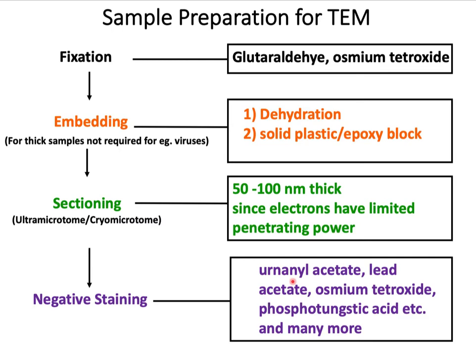The area with lots of stain bound will be very dark or black, moderately bound area will appear gray, and the area without any bound stain will appear white. We will visually see this in the next slide. Note that all electron microscopic stains are called negative stain as they are negative or dark, as the electrons can't pass through them, in contrast to a light or positive background through which the electrons pass without obstruction and hit the detector.